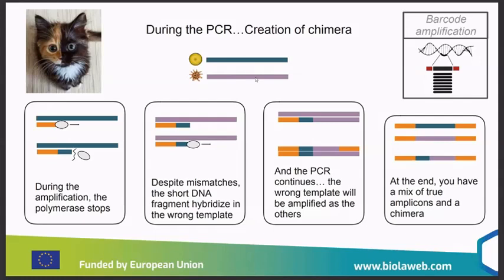It's done by algorithms, and they basically look for a sequence that is similar to one sequence and similar to another sequence. If you find that it is identical to two different sequences, they remove it.